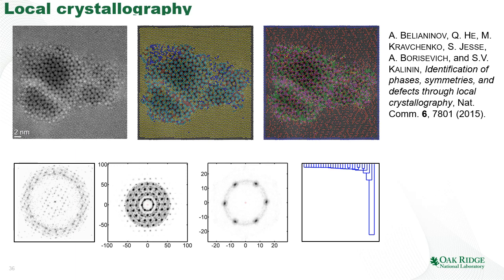So we can stop our clustering at some threshold, and then plot in different colors, to indicate the cluster to which the atoms belong. And all of a sudden, if we perform the clustering based on the lengths of the vector, we get this type of map. If we perform the clustering based on angles, then we get this type of map. But in the end, we start to get insight on where the different atoms are positioned.